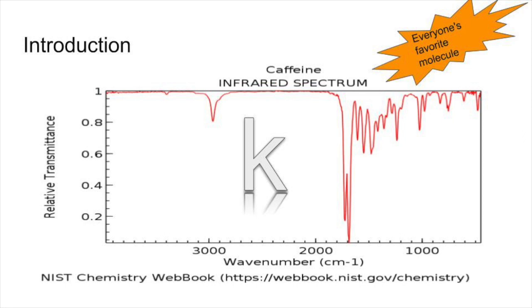Infrared spectroscopy is the analysis of infrared light as it reacts with a molecule. IR is widely used in lab environments to determine which functional groups are present in a molecule. The molecule being tested by IR can absorb, emit, or reflect light, and depending on the way a molecule vibrates, it can either be IR active or inactive.